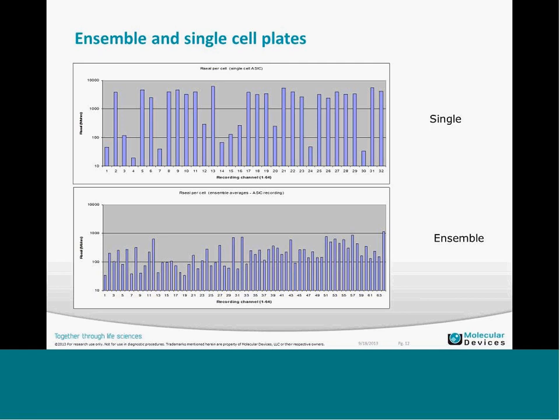So this is a video showing how cells in an ion flux system are attracted to the traps. What we're looking at is bath solution with cells flowing through. Up at the top here, you can see this is the trap. Here's the main channel where you have your extracellular solution with cells suspended in it. Inside this trap channel, you would have your intracellular solution, and this is essentially your patch electrode.